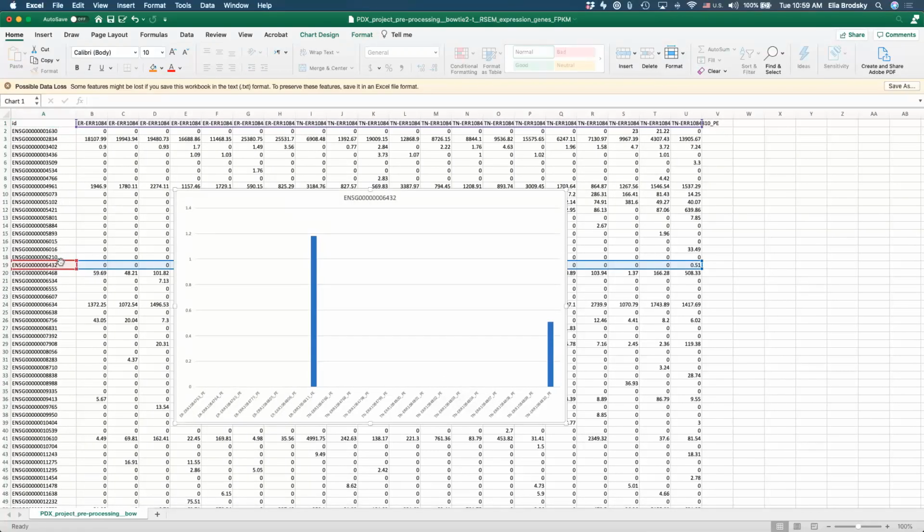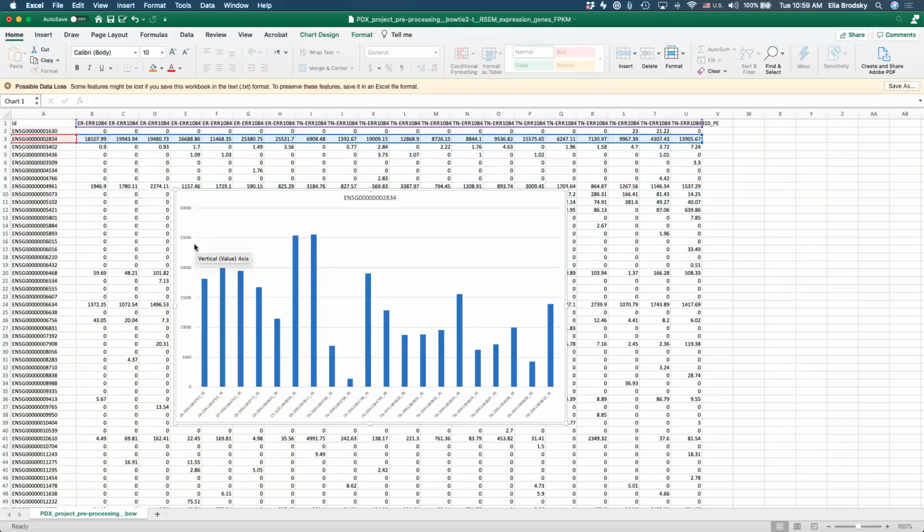Let's take a look at another example, and just to see the scale, okay? Look at the scale. 25,000 is the high level. The low level right here is 1,392, right? So the scale plays a role. The number of samples that have expression plays a role. And the normalization technique plays a role as well. But it's not as simple as just looking at those numbers. This is just to illustrate what types of examples we have.